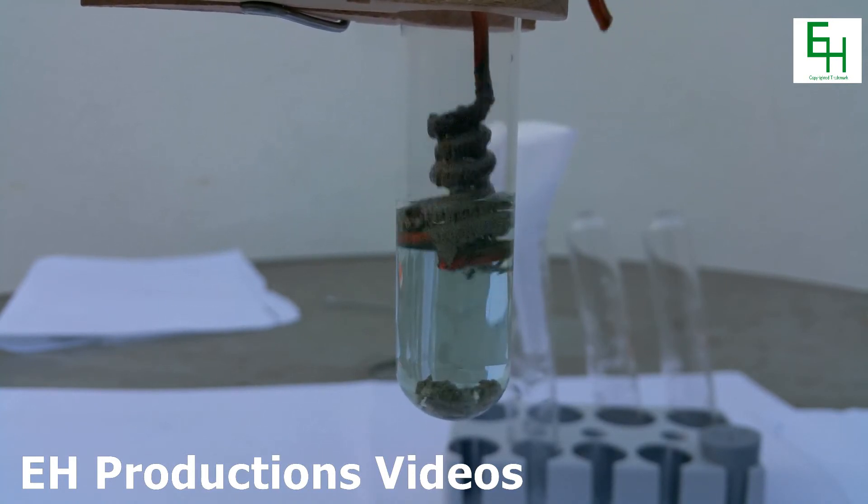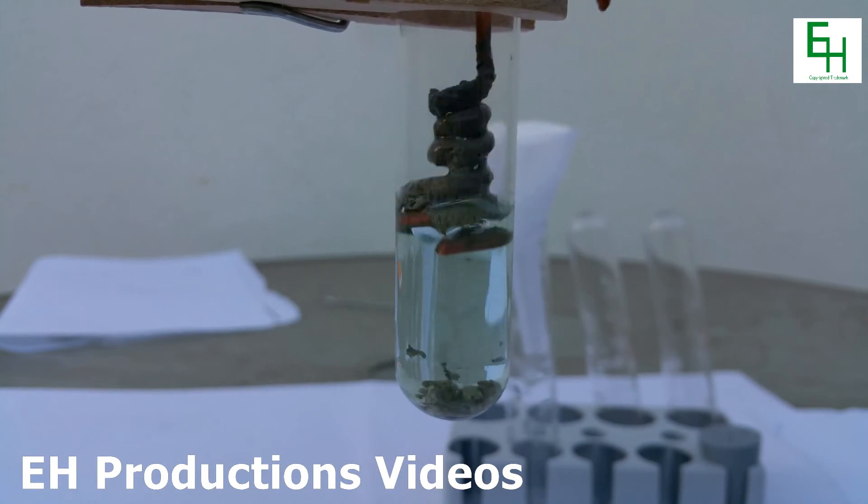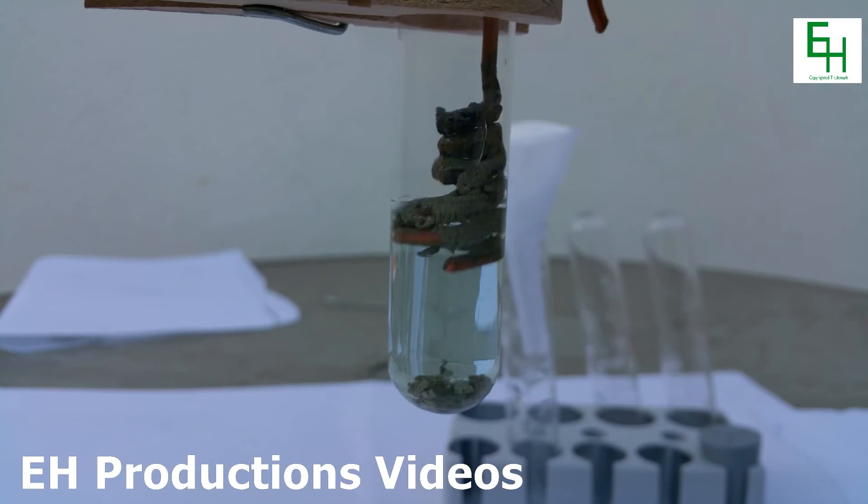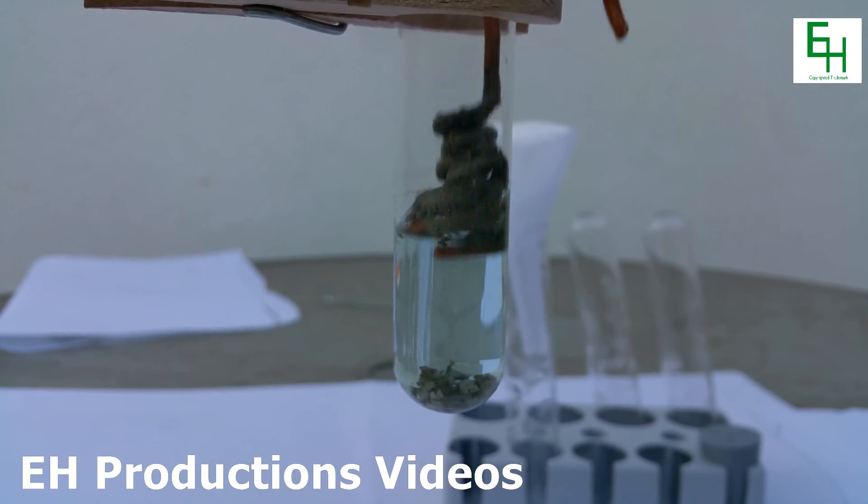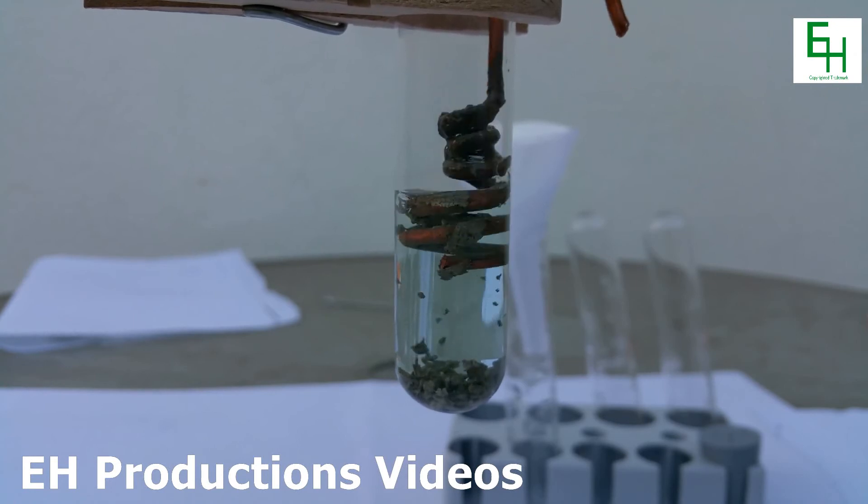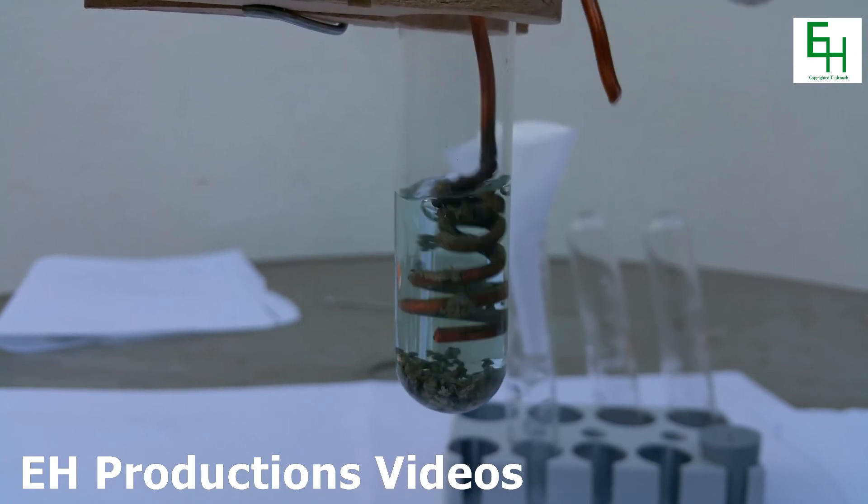And as you can see, most of the silver powder falls right off. I'm going to give it some more shaking. I'm going to try to get as much of the silver out as I can by shaking it.